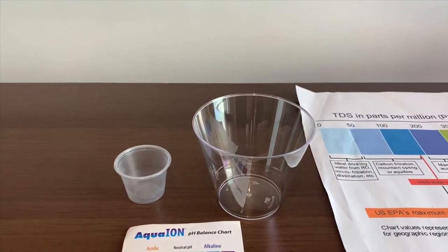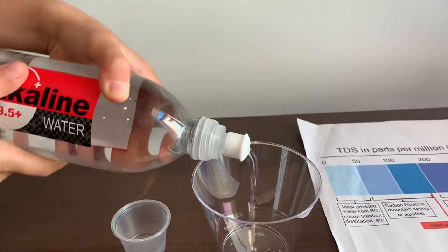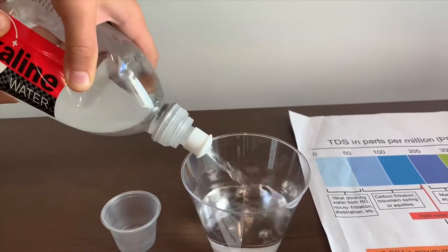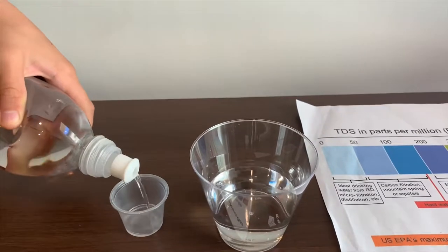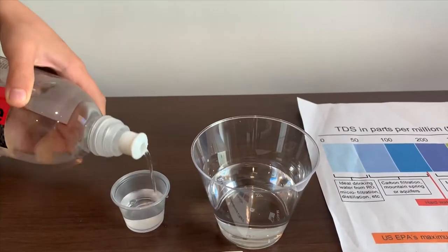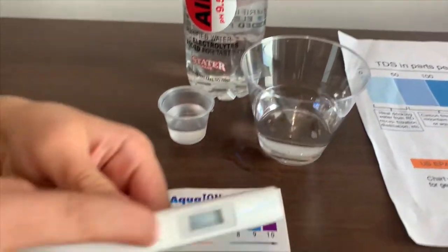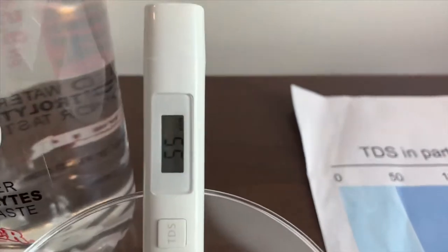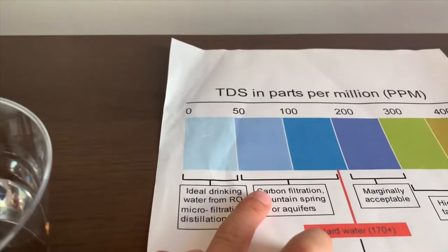Let's pour some water in. First, we're going to test the TDS level. Turn on the TDS tester. Make sure it says 0, and let's put it in. 55 — that is mountain spring water.